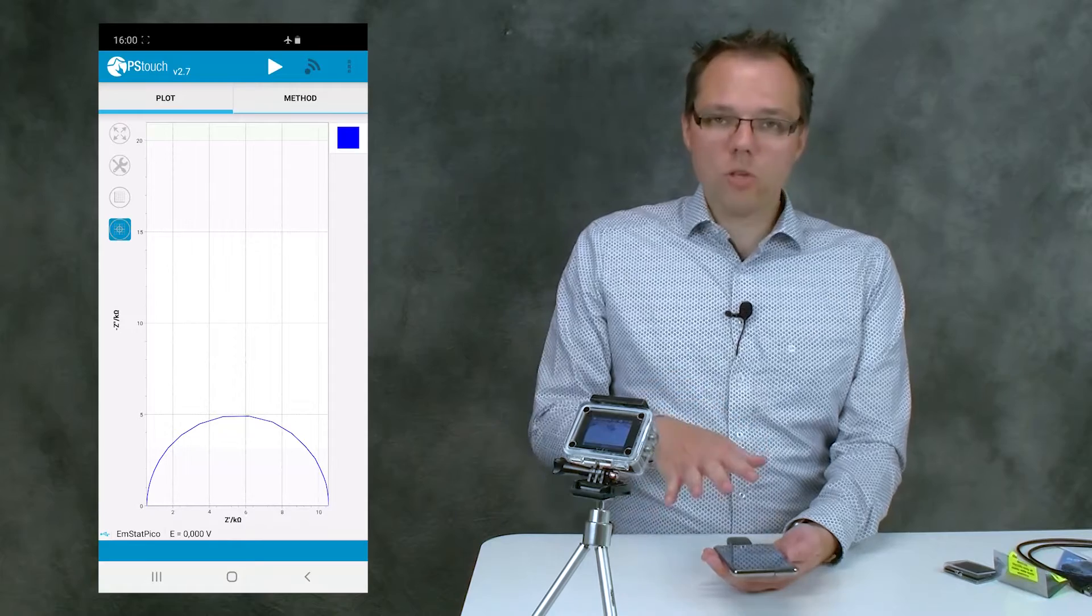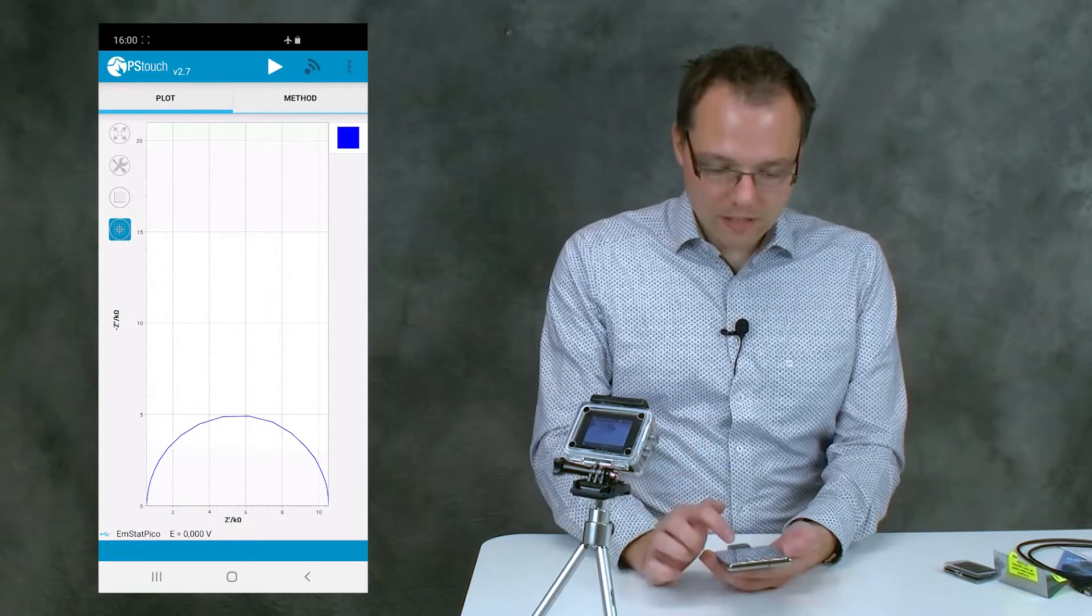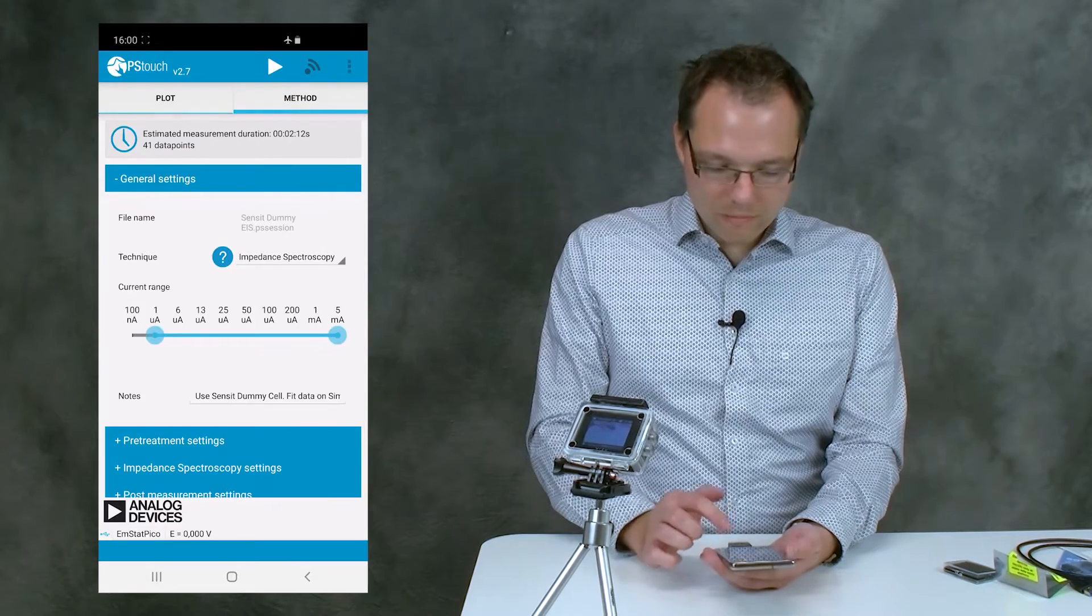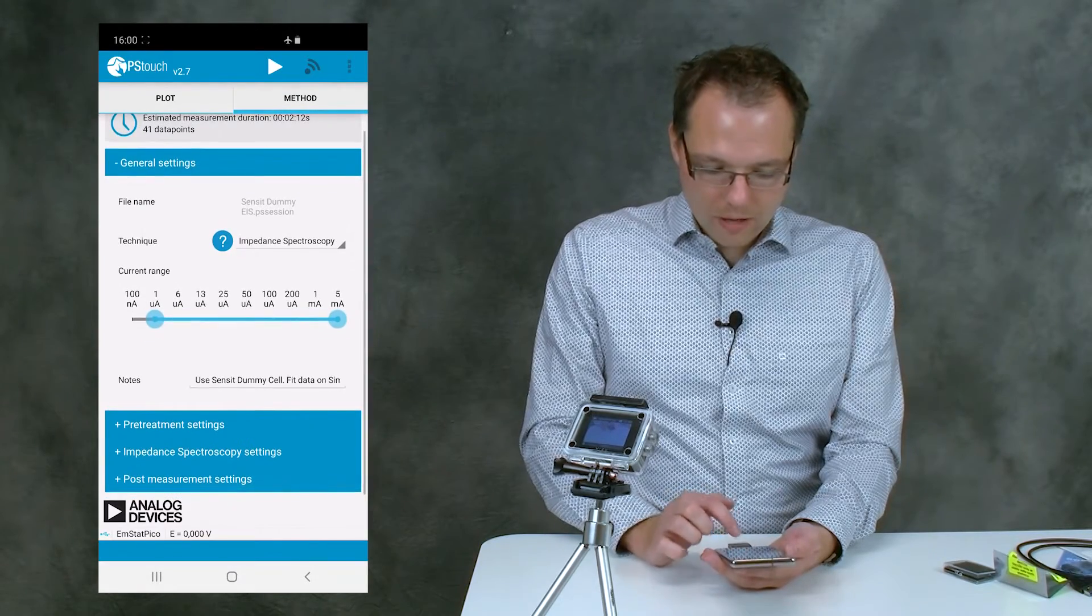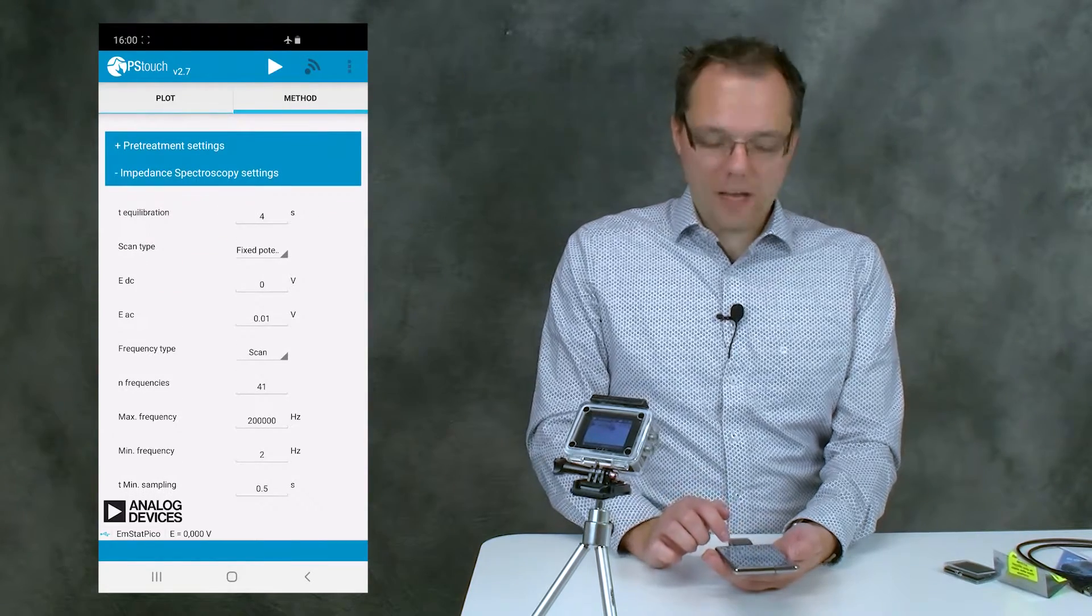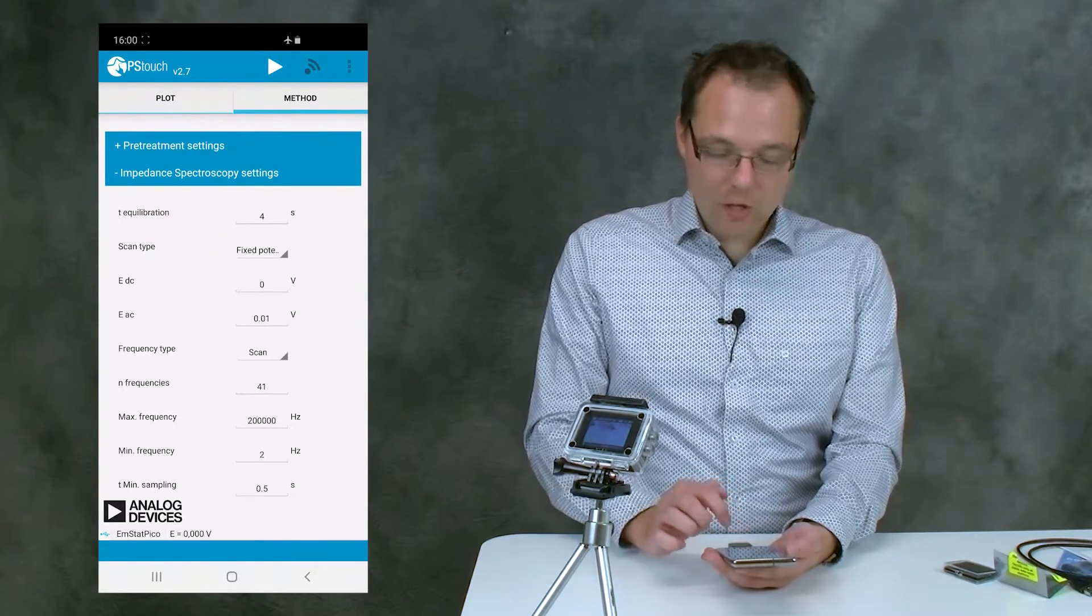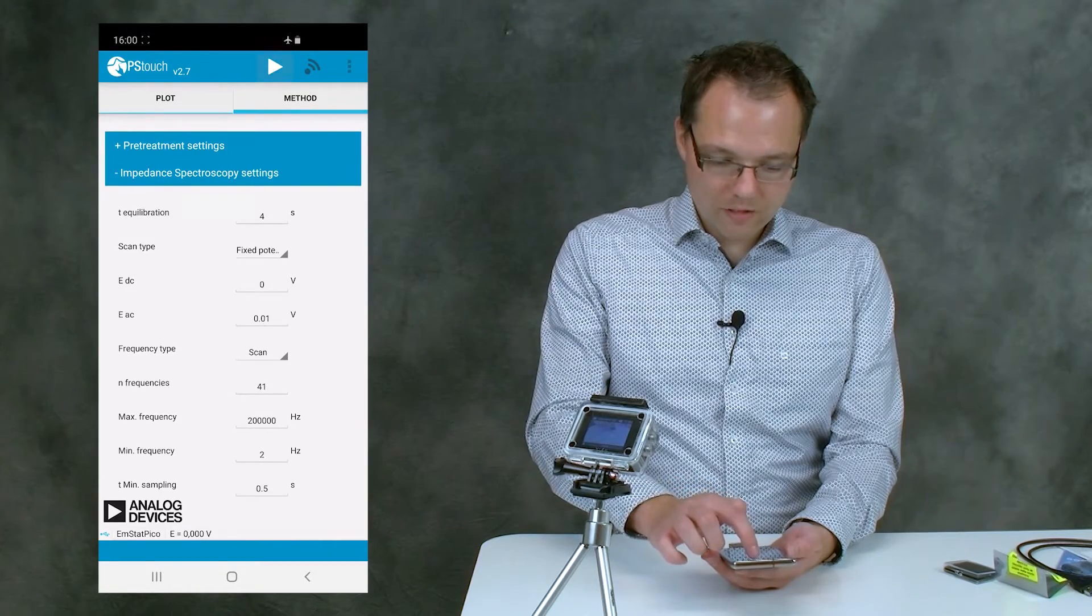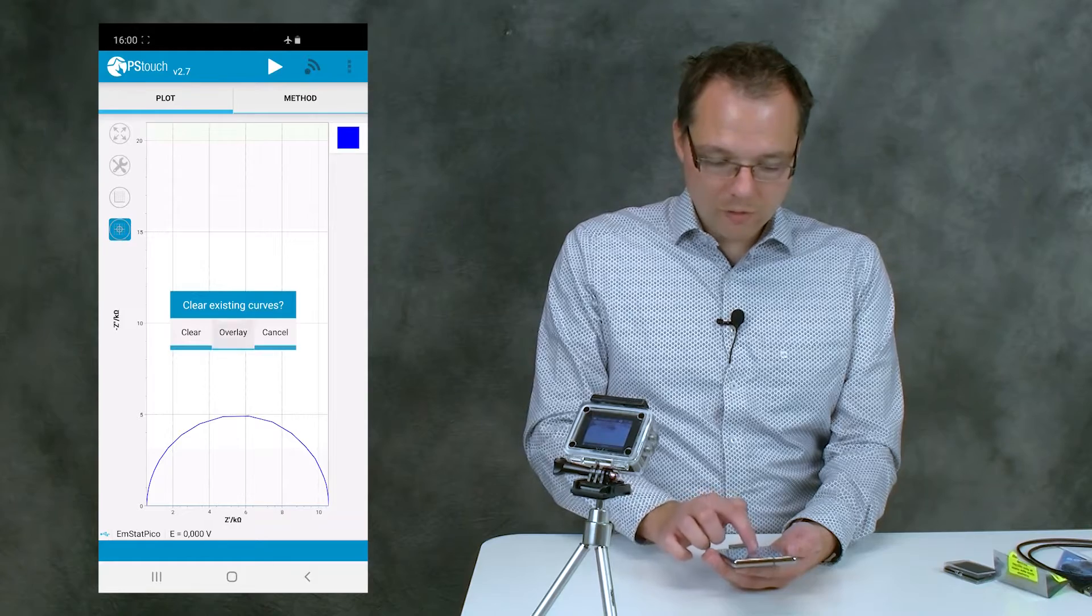Well, but that is now a loaded measurement. The advantage is that when you load a measurement, all of the method parameters are loaded together with that measurement. So we actually have all the parameters already set and can just press the Run button, and we want to overlay the measurement to see if it works exactly the same.